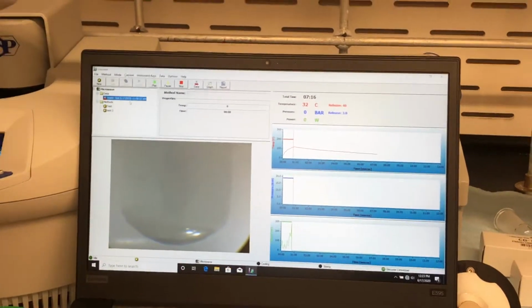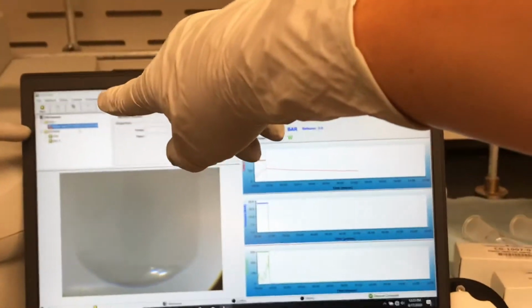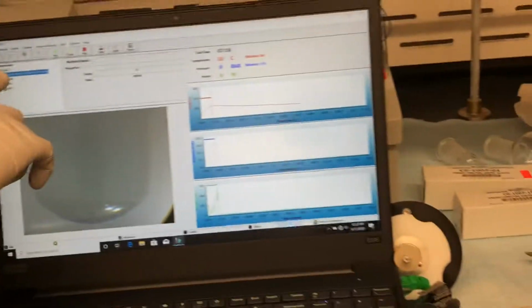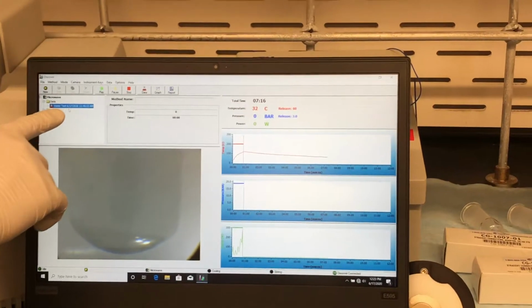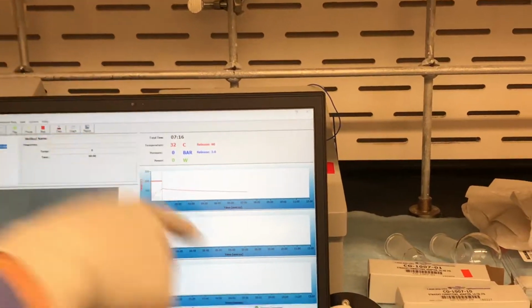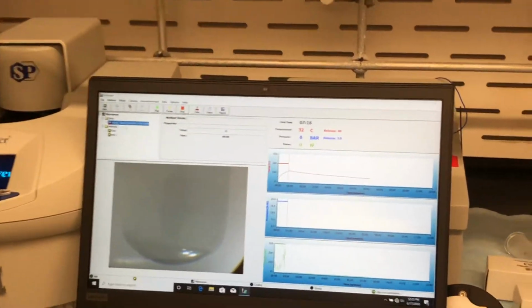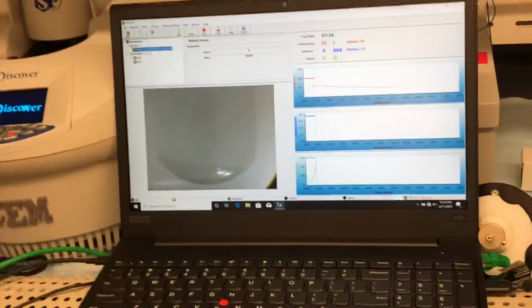This is what the sequence test was. It says test 6, where is it? Oh no, it's test 617. So that's the water test, which is the method. Oh, that's a date. Dates, yes, and then time. And I think the time I need to adjust because I believe it might be an hour fast. So that's how you would tell between each.